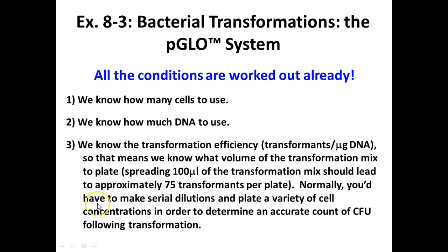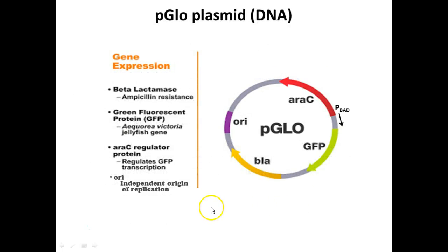If you didn't know, you would make serial dilutions, right? You would dilute out and do several platings to figure out what the efficiency is.